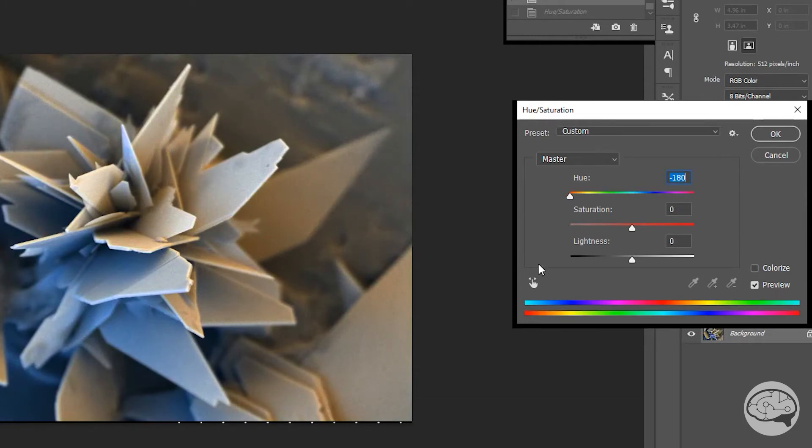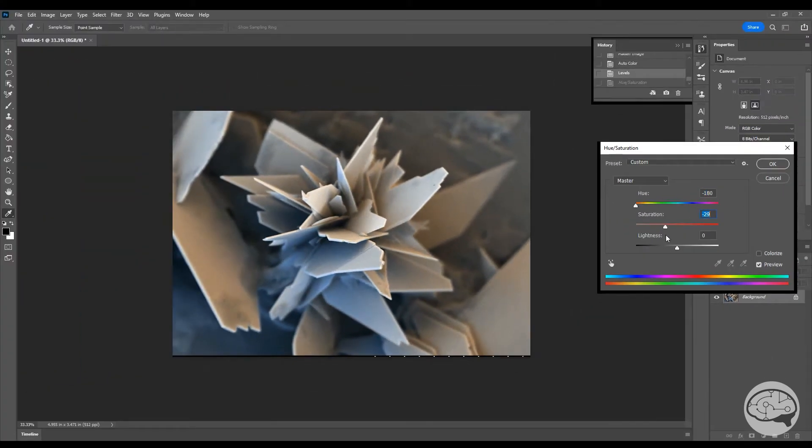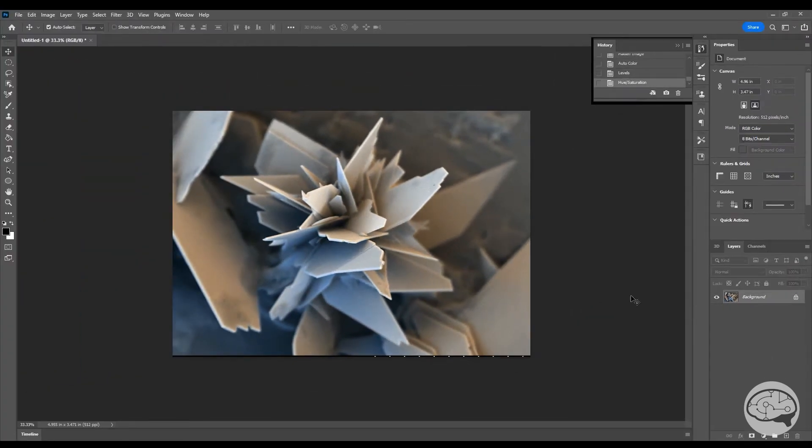The last thing we may want to play around with is saturation. Now, one of the main things that colorized micrographs do is they call attention to how not real their color is. One of the best ways we can take the edge off your fake colors is by desaturating them, at least a little bit. I suppose there might be some time when you might like to increase the saturation, but these colors that come out of this technique are going to be pretty strong to start off with, and we're mostly going to want to tone them down a bit. And there we have it. We'll maybe want to save this file as a PSD file so we can go back and make changes with it later if we want, but otherwise we're done.